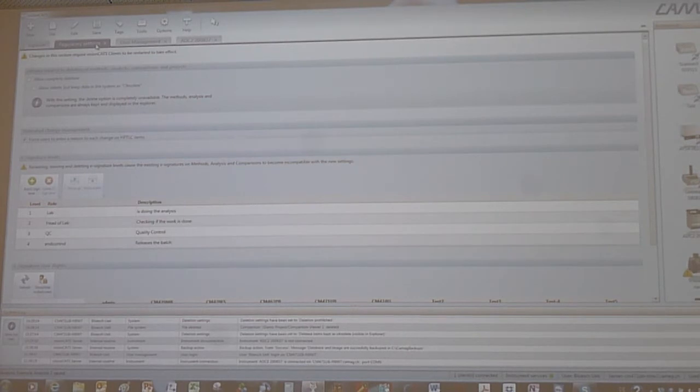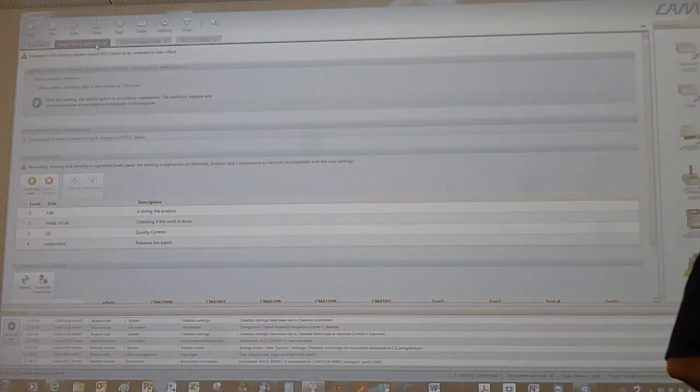So I also show this with this time thing. I like to show it because if the QC is here and he sees that, he knows, okay, they were thinking about 21 CFR, so they are okay. So showing it gives you some credits with the QC, where you certainly would like to have some credits, because otherwise you're a poor guy.